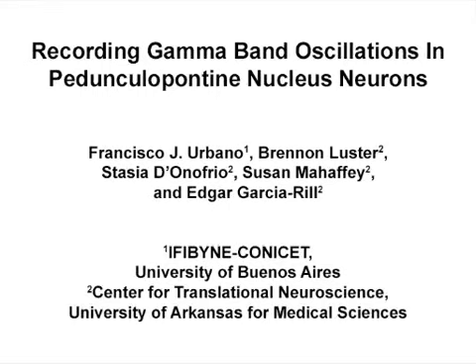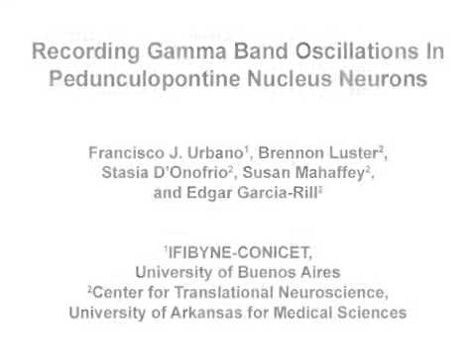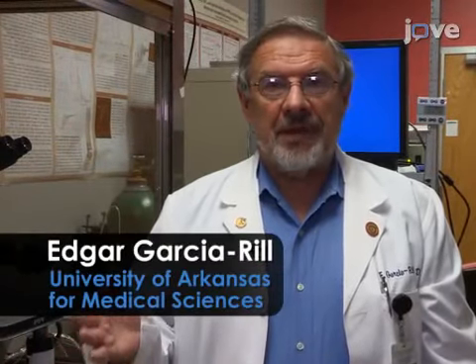The overall goal of this demonstration is to describe a method for detecting high threshold and subthreshold oscillations in pedunculopontine neurons. This method can help answer questions about, for example, how cells maintain their firing frequency. How do populations maintain their firing frequency?